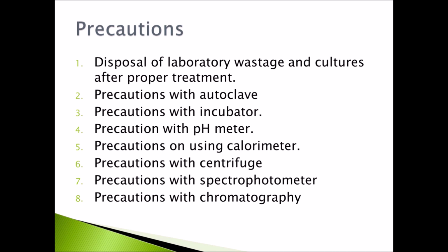Now, about chromatography. Pencil should be used. The ink stain can move up off the chromatography paper and there may be error. Before placing the chromatography paper in the solvent, it must be dry. Make sure the paper is dipped in the solvent. Chromatography is a separation technique mainly used to separate mixtures.